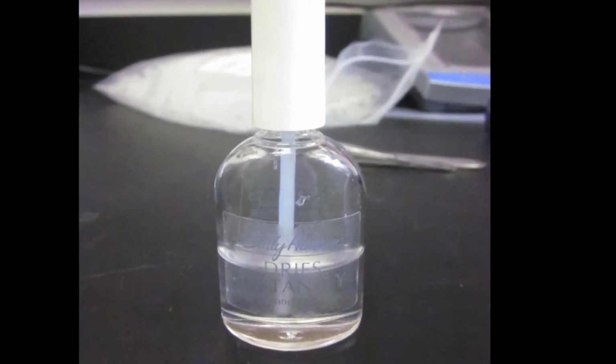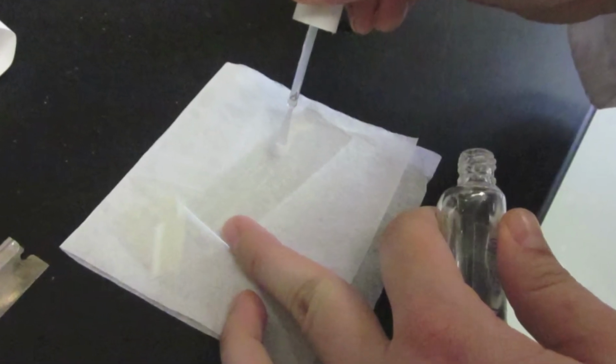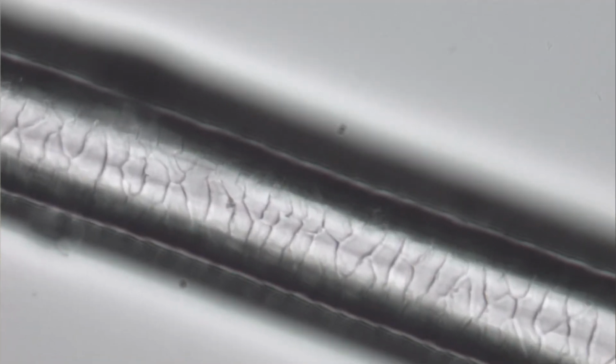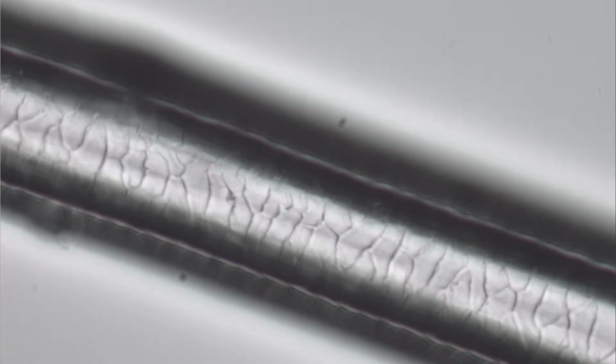The scale cast requires nail polish or a Polaroid film coating as the mounting media. The analyst will first place the mounting media on the slide. He will then place the hair into the mounting media and let the media dry. After the media is fully dried, the analyst will remove the hair from that slide. This type of mounting allows for a visualization of the scale patterns located on the outside of the hairs, or the hair shaft.